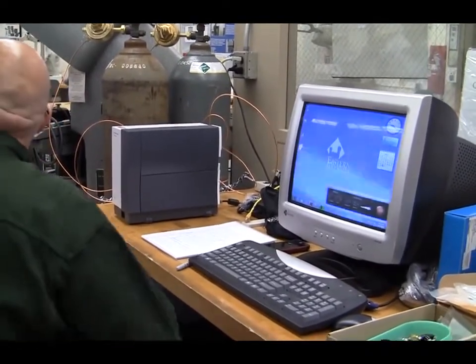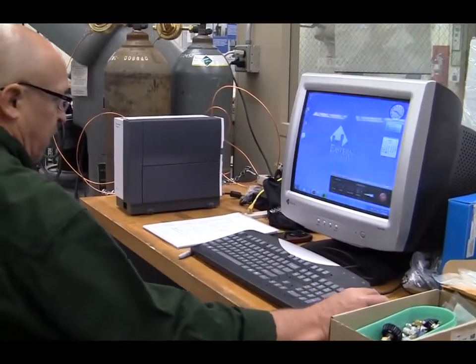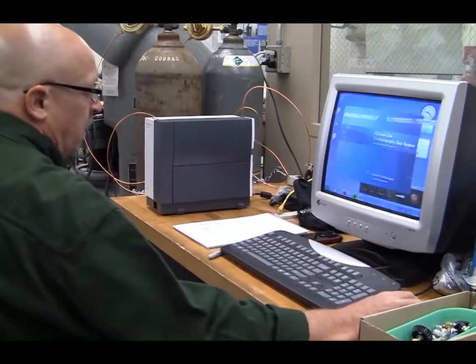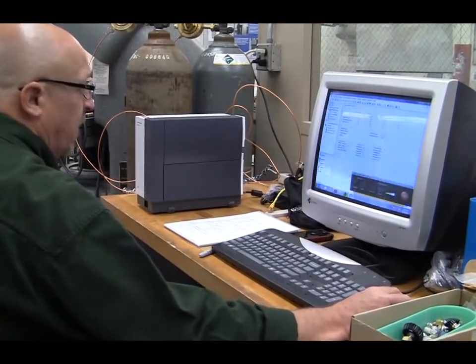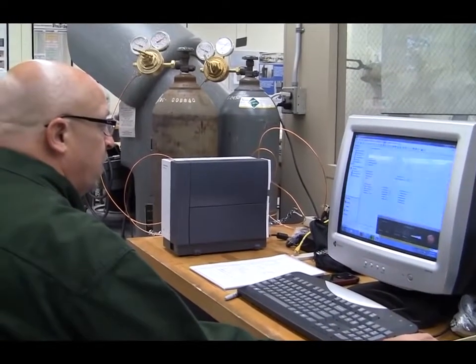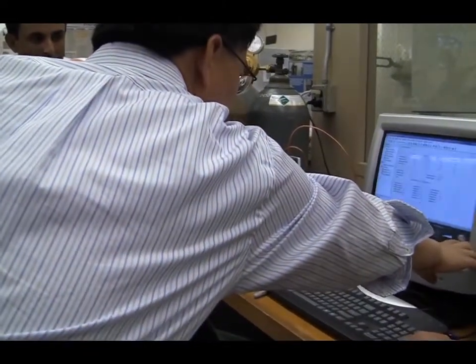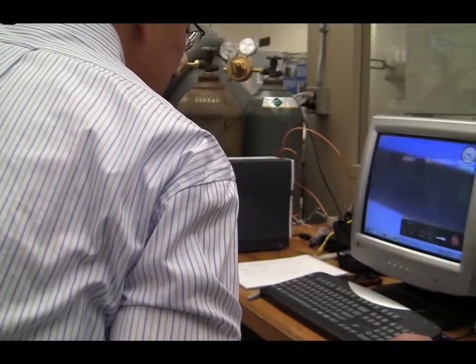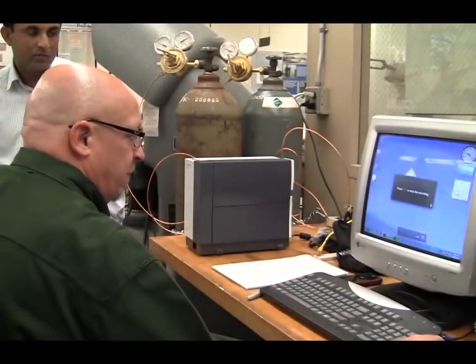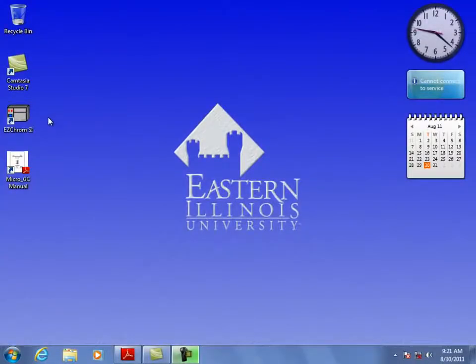So in the process, the first thing it does is go through and do a flushing of the system, and in fact, we'll open up the software so we can tell what's going on with the analyzer. So go to control. There it is. There's a communication error. Oh, we got this communication error. I gotta clear it up first. Probably didn't want us to talk to it while it was going through that initial startup.